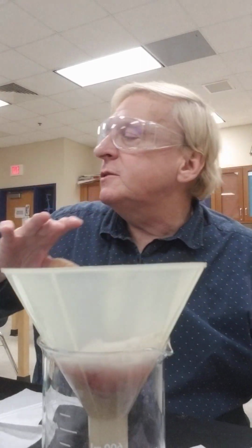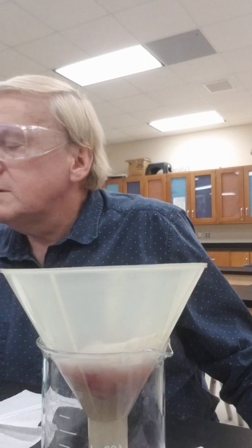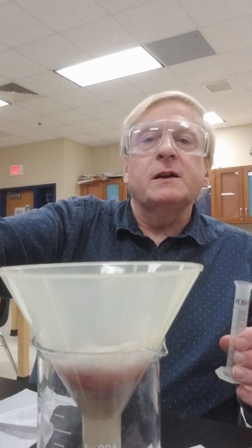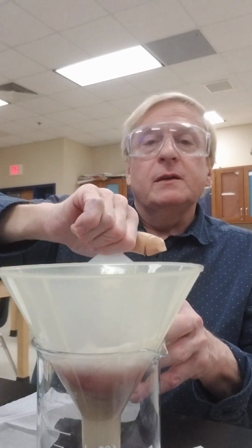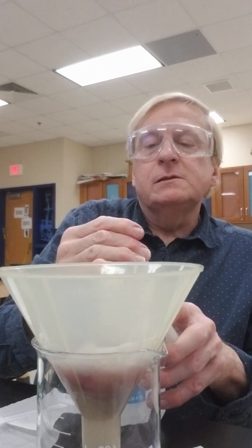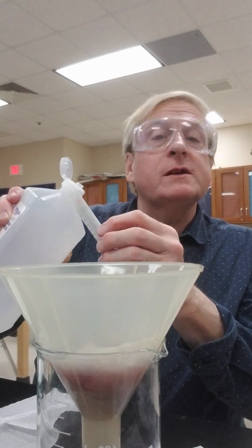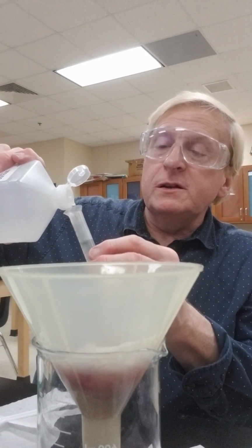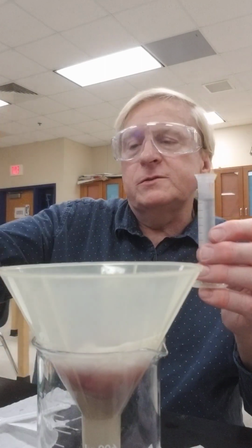Once it has dripped through really well, I'm going to take some isopropyl alcohol, preferably chilled. Like I said, this one has a pop top. I've removed the safety seal there. This way I can, without shooting it in your eye, see I've got safety eyewear on just in case. I'm going to measure out about 10 milliliters of this isopropyl alcohol. You can go with a little less. 10 milliliters should be good.